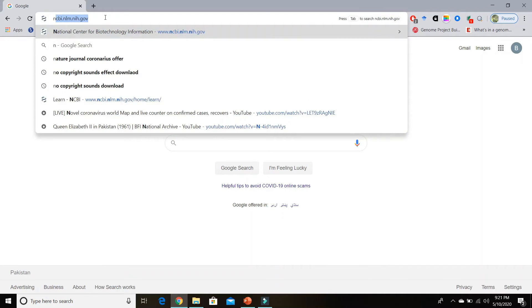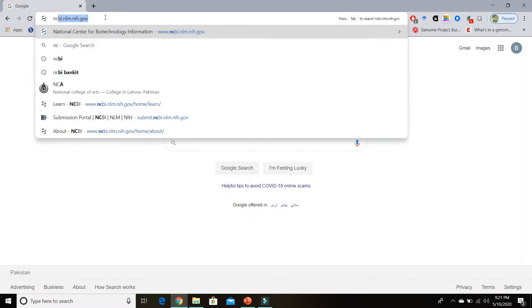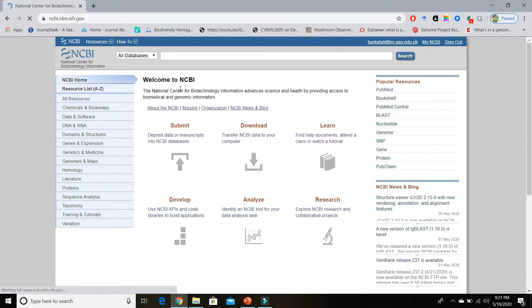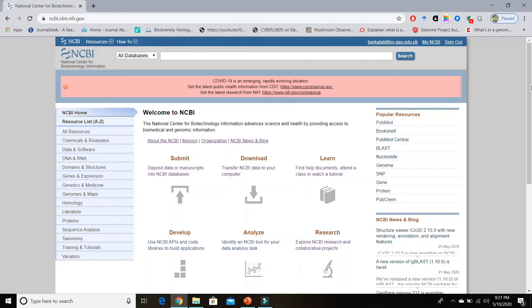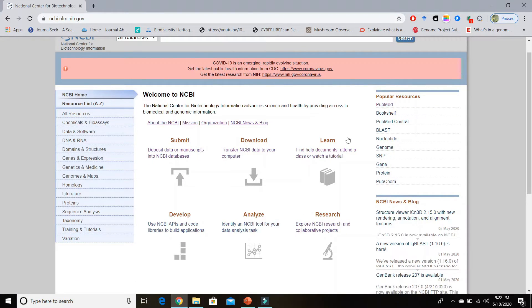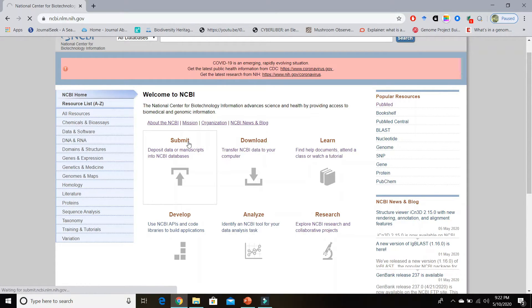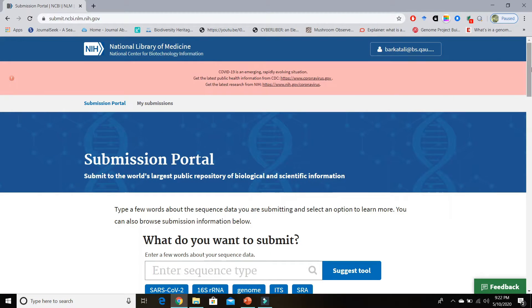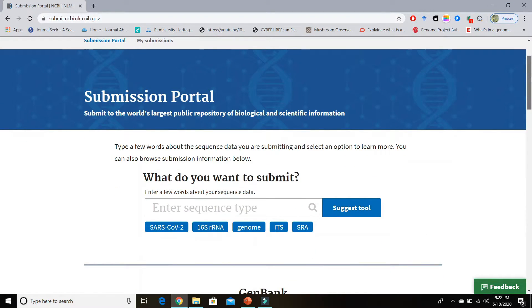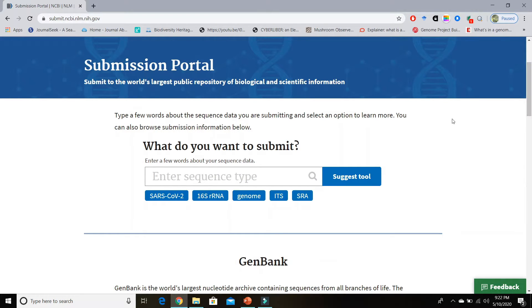Just type the NCBI web address and hit the Enter button — it will open the NCBI homepage. On this page, if you look on the left-hand side you will see the Submit option to deposit data or manuscripts into NCBI databases. Click on the Submit button and it will open the Submission Portal page where you can start your submission.